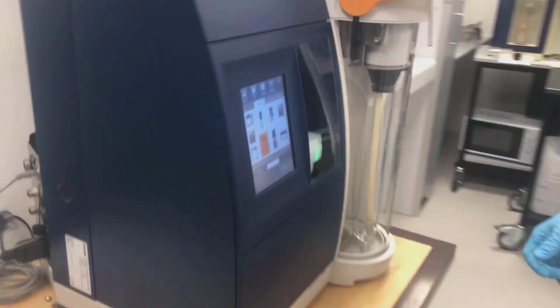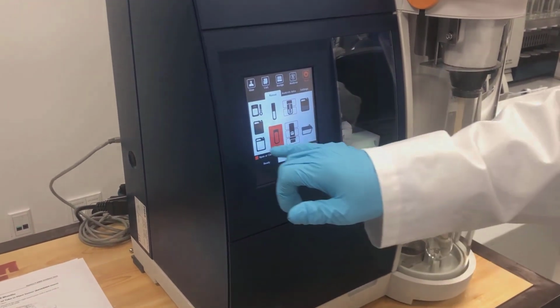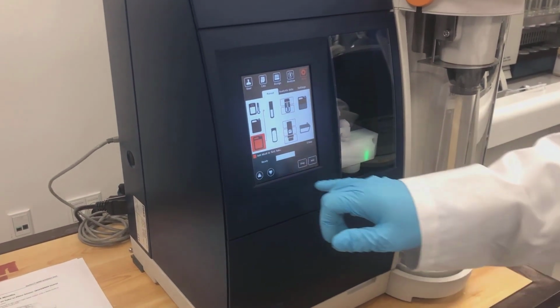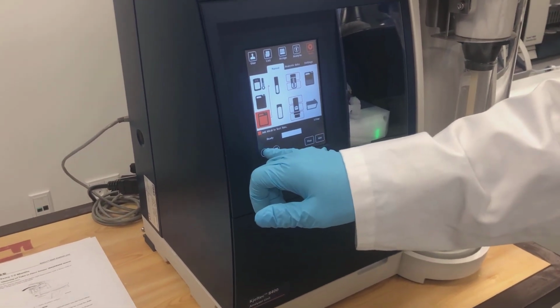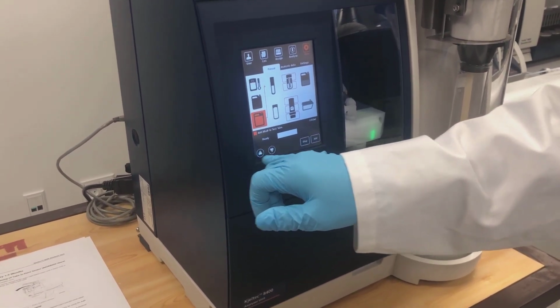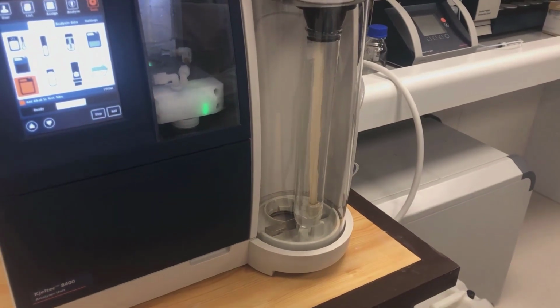We move to the instrument side and use manual mode to add ALKALI. You can choose the maximum volume, like 150, and try to add. Now you see the dose pump is working.